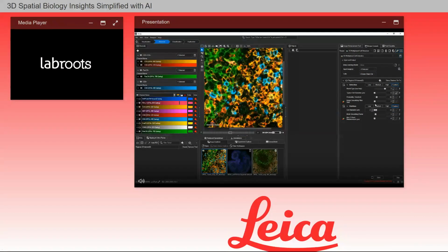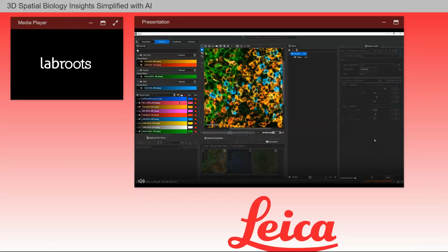In the recipe, I can use the text box or the slider to adjust the detection parameters. I can use the red and green arrow button to select a different processing step from my recipe, like adding a smoothing option or switching between two different partitioning options. And finally, you can click on this button to generate a preview of the recipe output on your image. As I have already defined the optimum parameters for this dataset, I am going to click Start to apply the recipe.